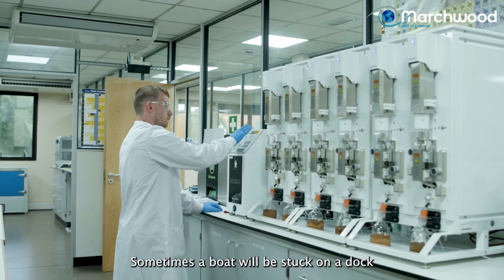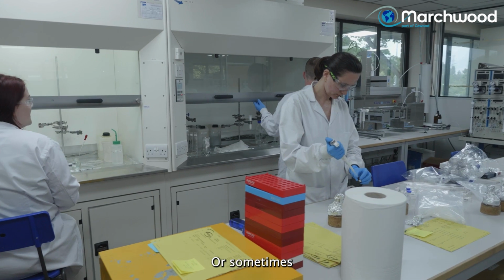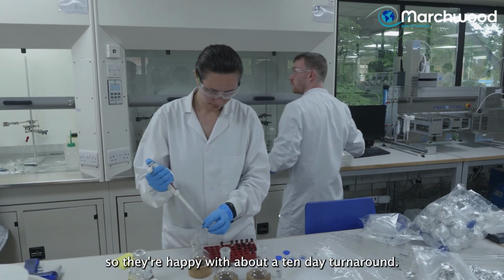Sometimes a boat will be stuck on a dock somewhere in the world, so they'll need the results the next day. Or sometimes it's part of a quality assurance scheme, so they're happy with about a 10-day turnaround.